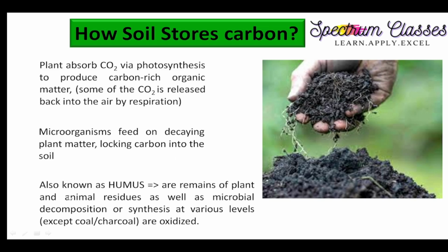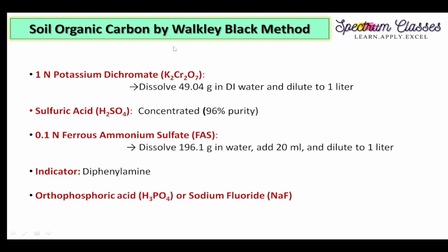These things are also known as humus, or we can say this is the upper layer of the soil which you can see here, and it has remains of plants and animal residues as well as microbial decomposition or synthesis at various levels, oxidized in this layer of the soil, which is responsible for the storage of carbon in the soil.